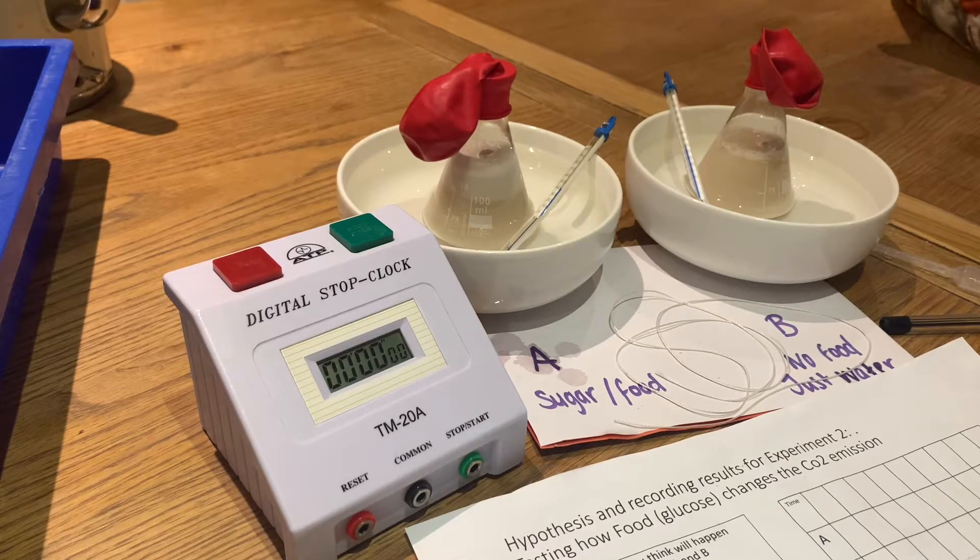This is experiment two. I have decided to use the temperature of 36 degrees, based on the results of experiment one.